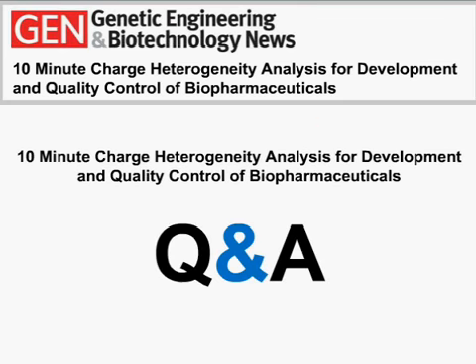Okay, so we're ready to begin our Q&A session, and let's take the first question from the audience. Okay, Scott, we have the first question for you. Do you have a robustness study for the HT cartridge? How many injections can be injected through the HT cartridge before it expires or retires?